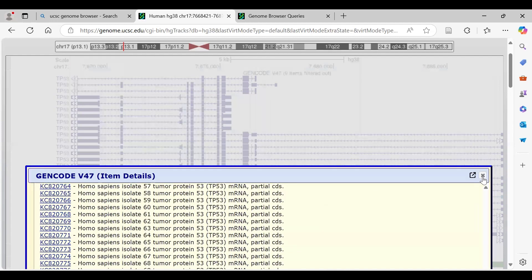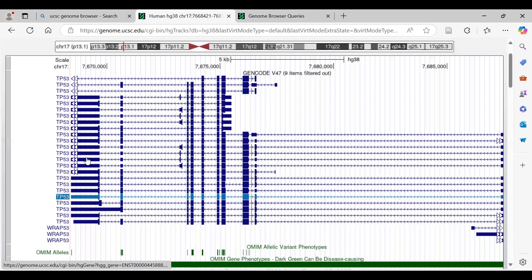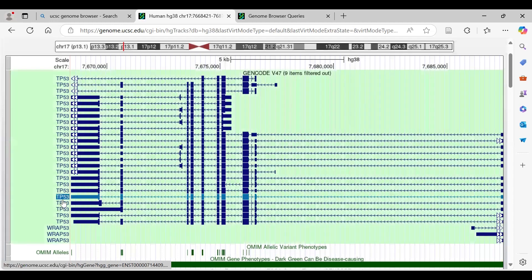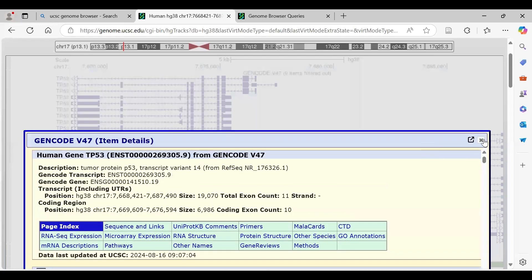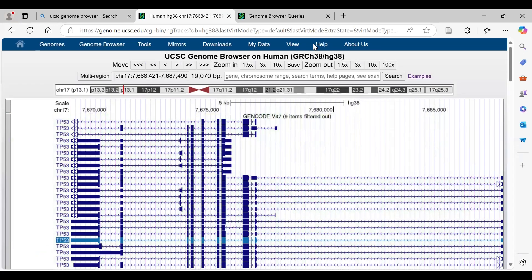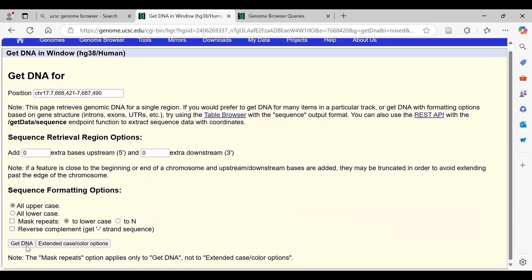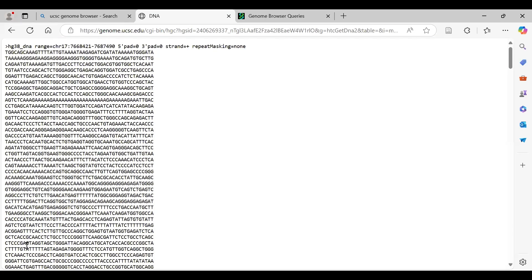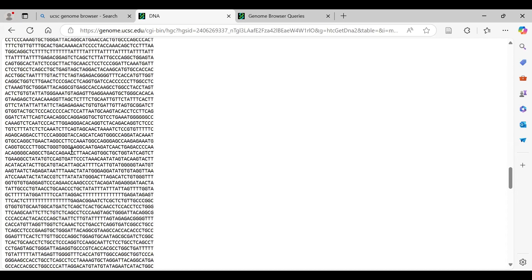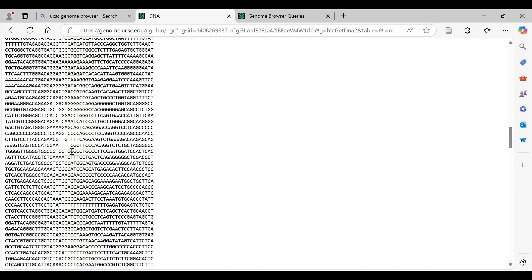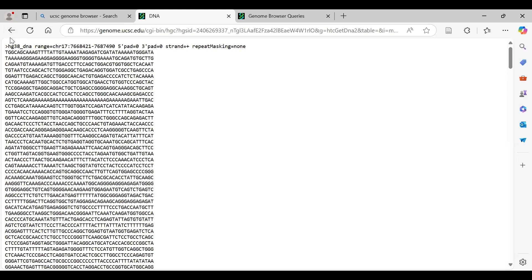If you want to retrieve the sequence, simply select the region, go to View, then DNA sequence. The position is already selected. Scroll down and click 'Get DNA' and you will get the FASTA sequence, which you can copy and use for further analysis.